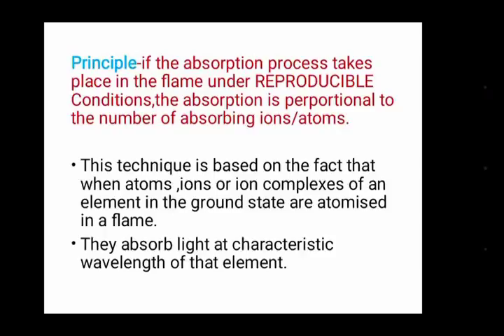If the absorption process takes place in the flame under reproducible conditions, the absorption is proportional to the number of absorbing ions or atoms. This technique is based on the fact that when an atom, ion or ion complex of an element is in ground state or atomized in a flame, they absorb light at a characteristic wavelength of that element.